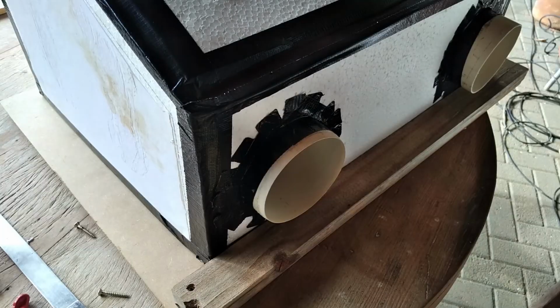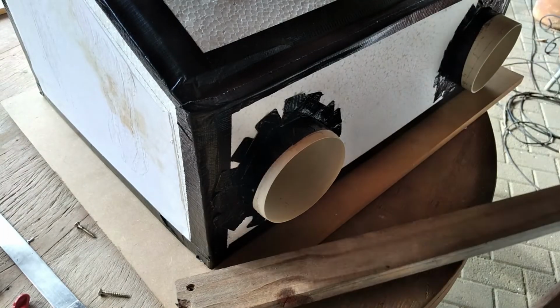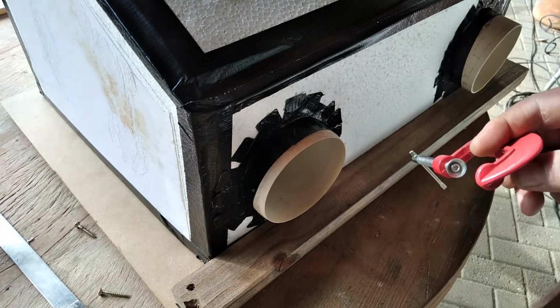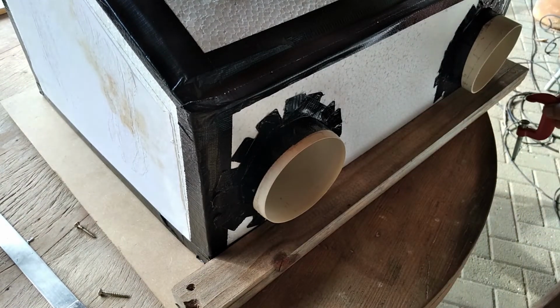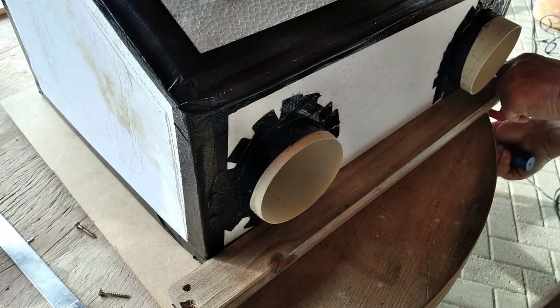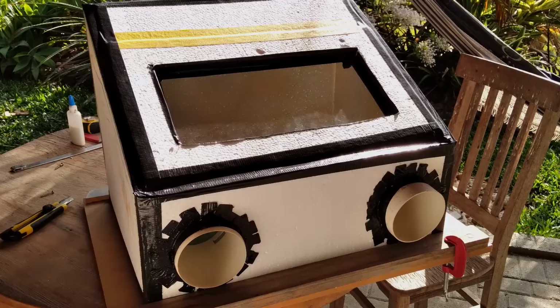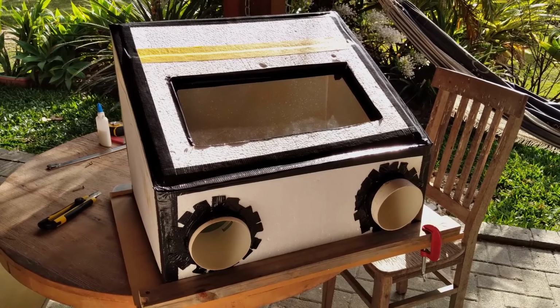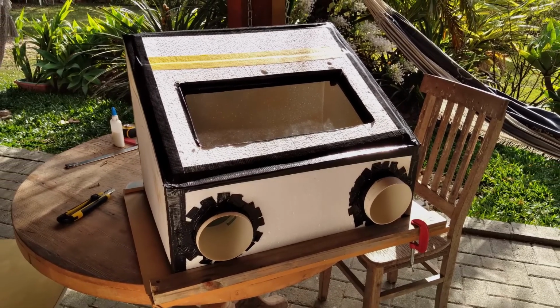Use a screw for a hinge on this piece of wood and a clamp to close it tight so the box doesn't flex and stays put when you use it. Et voila! Here's our glove box for sewing procedures that require a contamination-free environment.